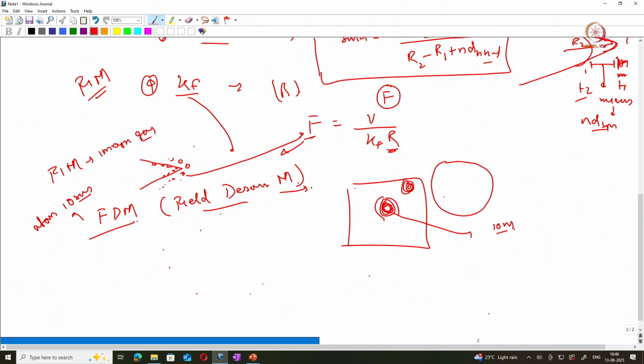So similar to FIM, you can also measure the xi value. This is related to the crystallography by theta observed. You can get the R0 determined by the ring structure depending upon the terraces. Correct. So here the R0, in that equation you have a theta n, which is the angle between the center and the edge of the nth terrace around the pole.